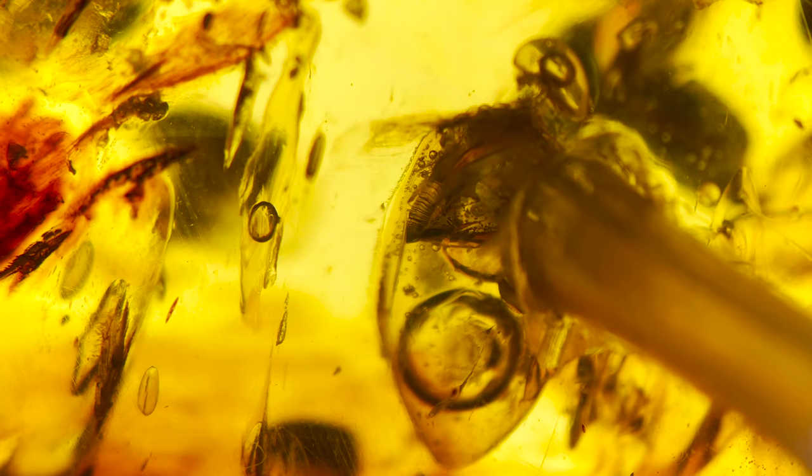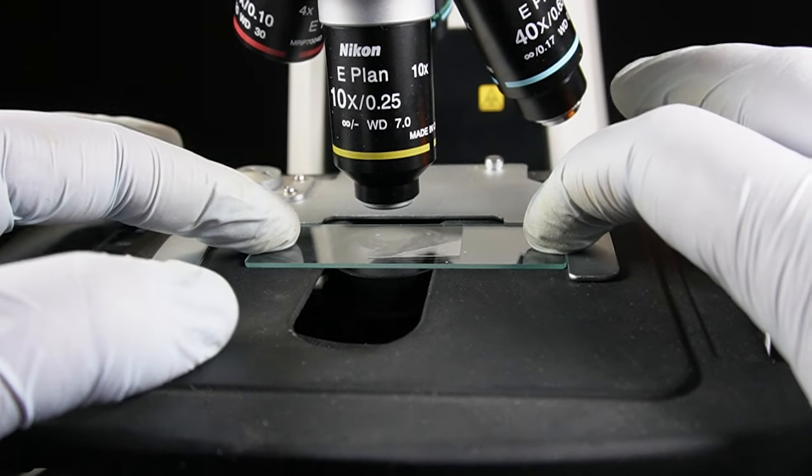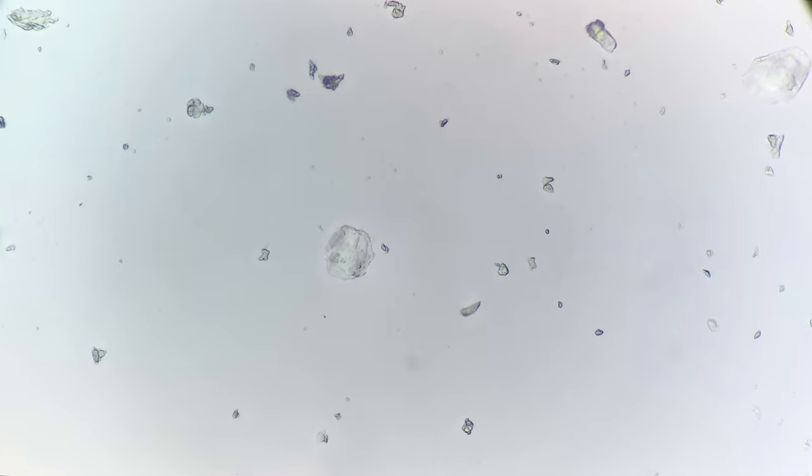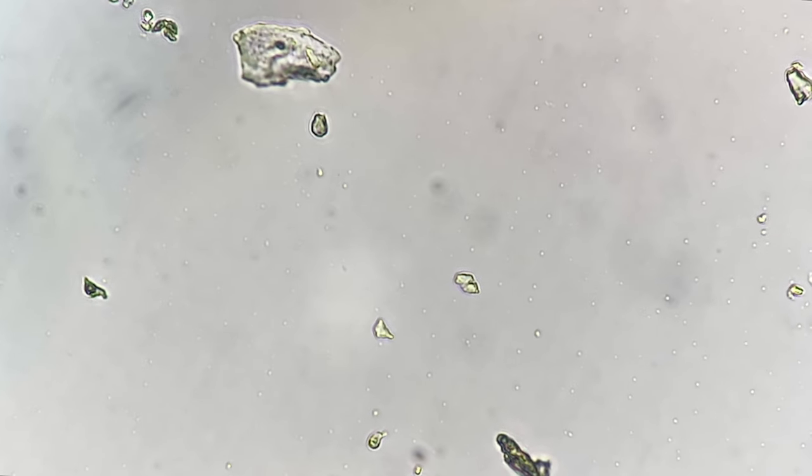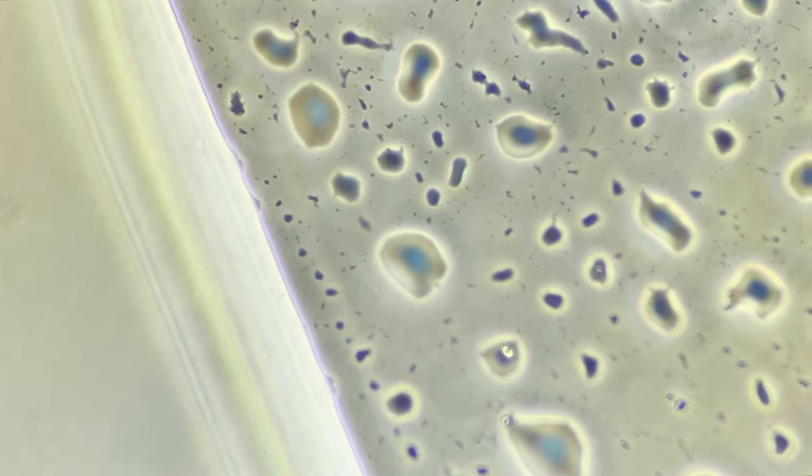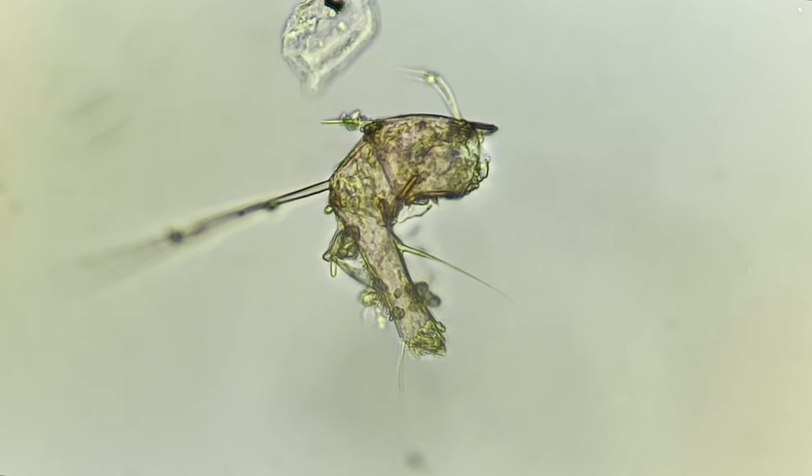You can see that moment here in the footage. After breaking through I then carefully transferred some of the water to a slide. Now this sample is quite interesting. I'm not really sure if it was the flow of the water but I think something moved. The concept of opening a fossil that was isolated for 99 million years is wild.